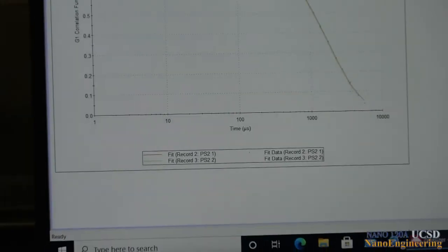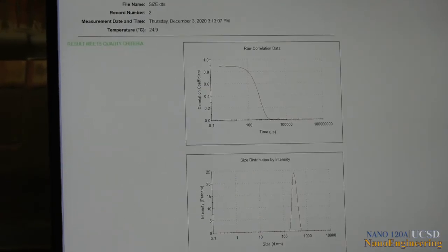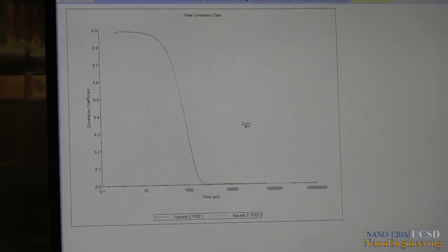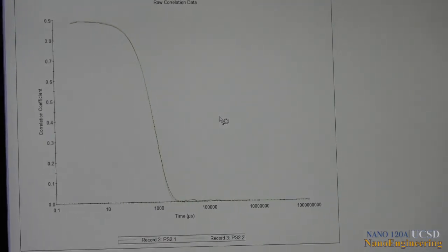I'm not going to walk you through the software step by step, but the protocol that we give you is going to walk you through that. But what you can appreciate, I'm really glad that you can see this raw data. And so we'll also include a bad particle whenever you do this from home. So let's pause the video, and then we'll go on to Zeta.